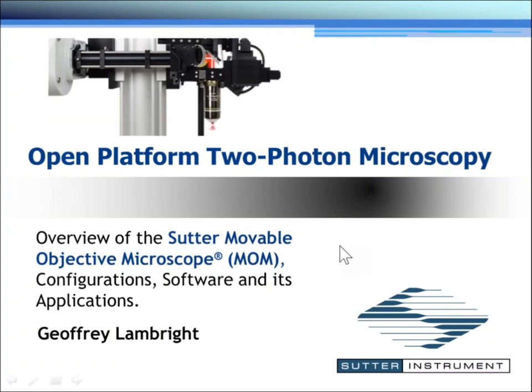Welcome to my webinar on Open Platform 2-Photon Microscopy. Today, I will be talking about the Sutter Movable Objective Microscope, aka the MOM. We'll discuss its configurations, the software that runs it, and of course, applications that it performs.